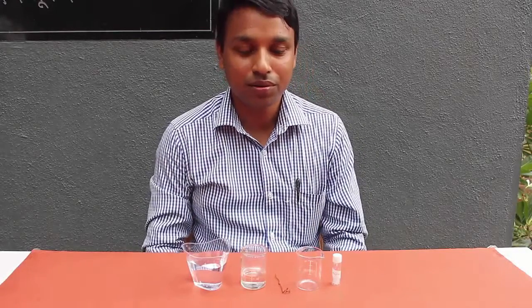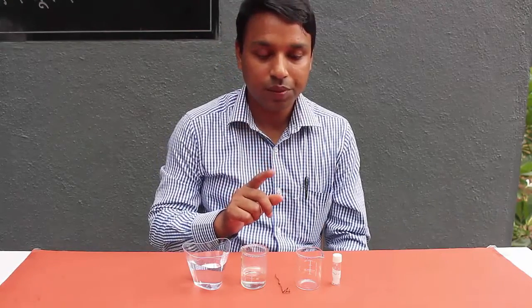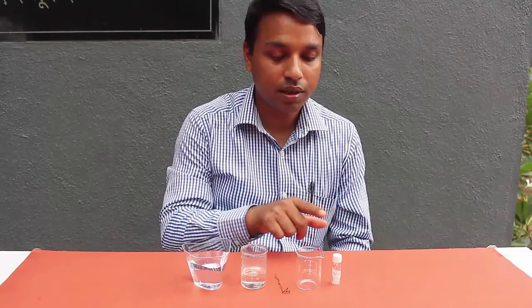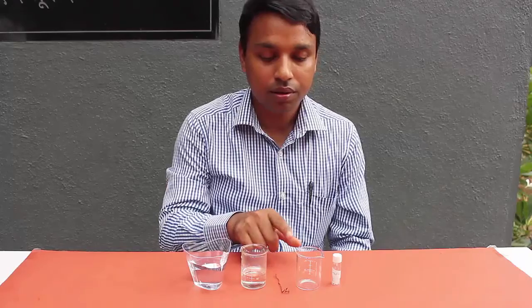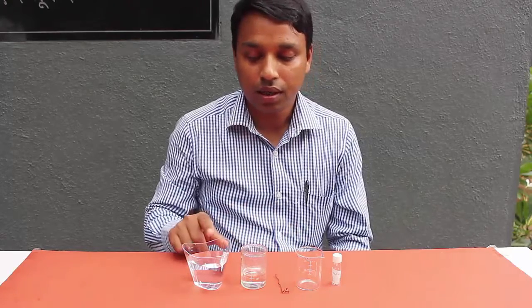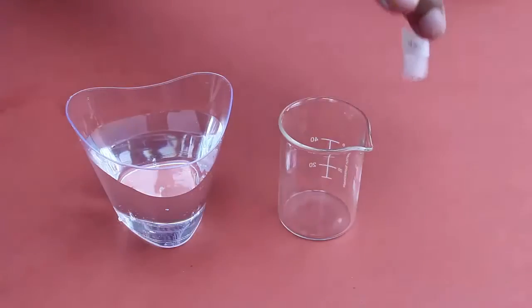In today's chemistry experiment we will see how an iron wire bleeds. For this we need two chemicals: ammonium thiocyanate and nitric acid. We also need a piece of ordinary iron wire, an empty beaker, and a glass of water.